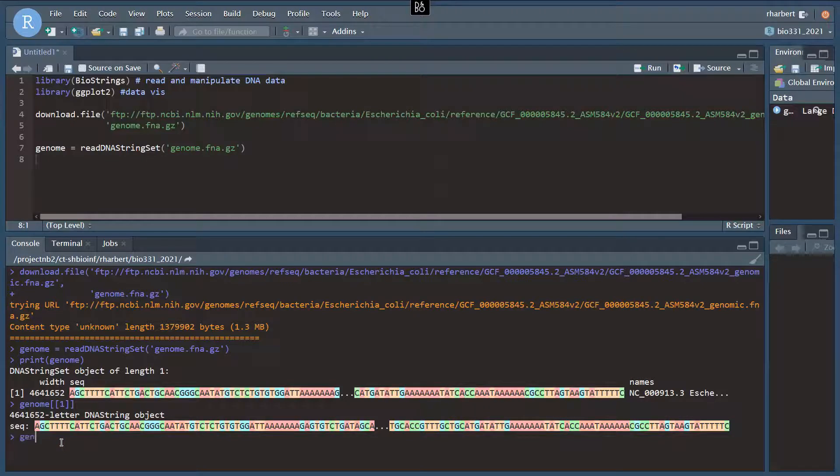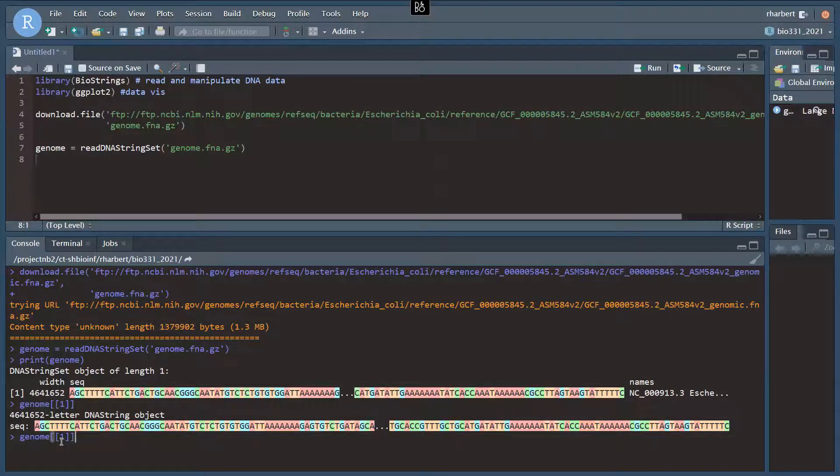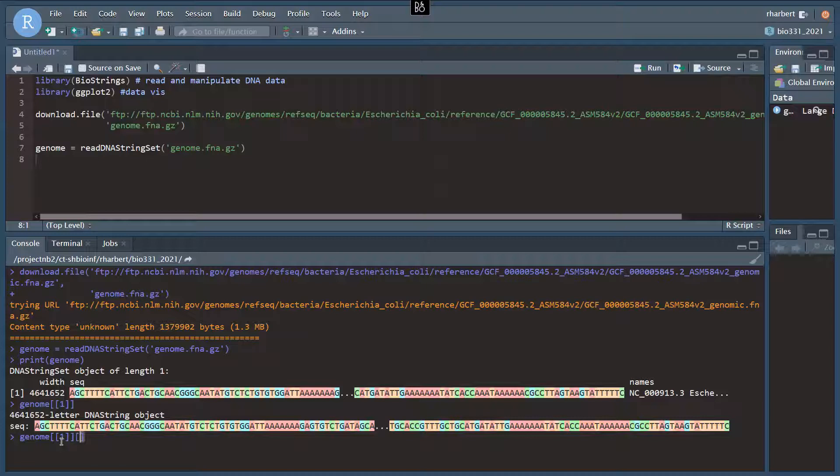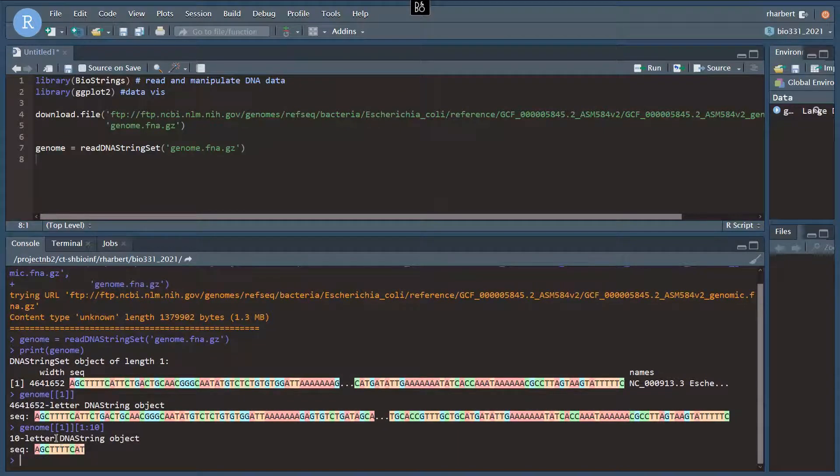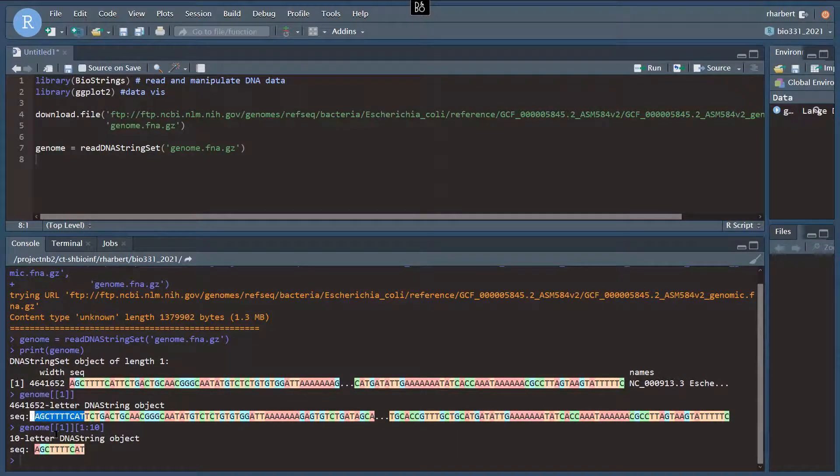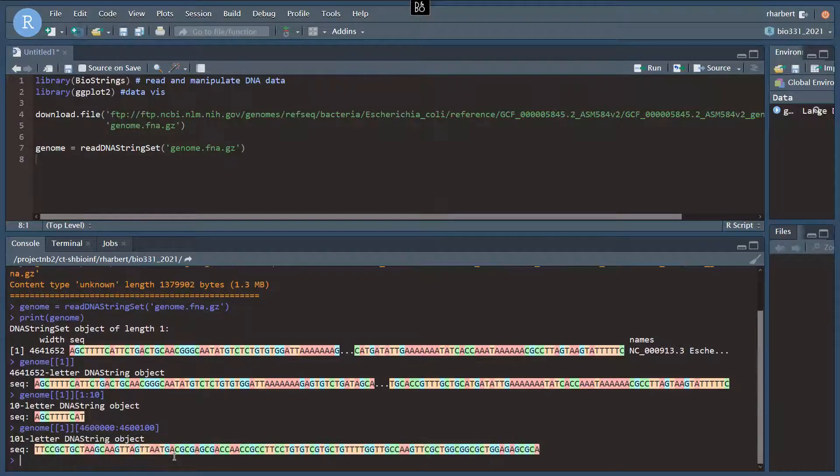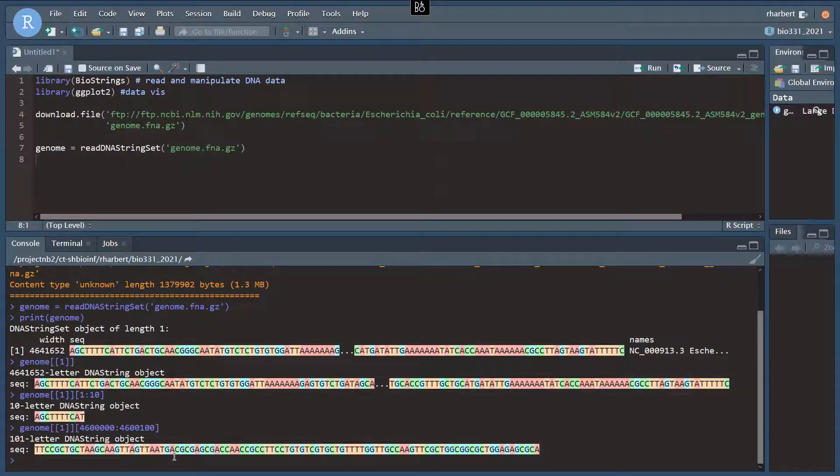All right. So just to get us started, let's just try a couple of subsetting methods here. So we do genome 1, and it's going to work just like a regular vector. So we could do the bracket notation for a vector, and we could do something like 1 colon 10 to do elements 1 through 10. And that's going to print just those first 10 nucleotides from here. Let's do another one. It doesn't matter where along the sequence we do. So we could do 4,600,000 to 4,600,000 and 100. And that's going to print 100 nucleotides, 4,600,000 nucleotides in.